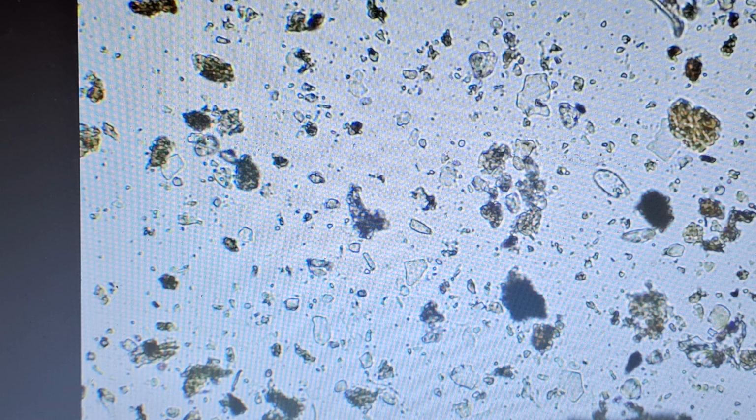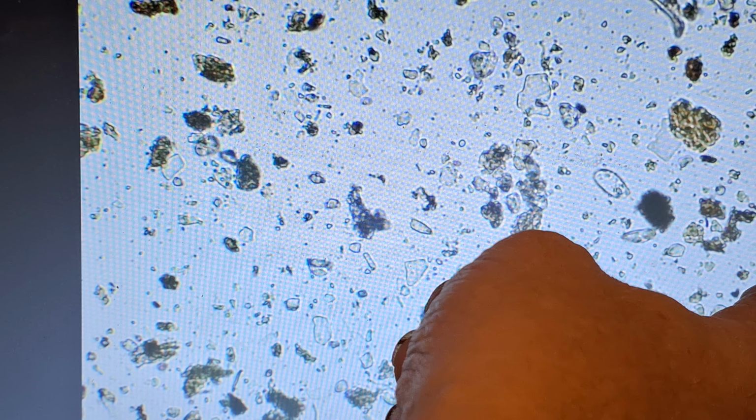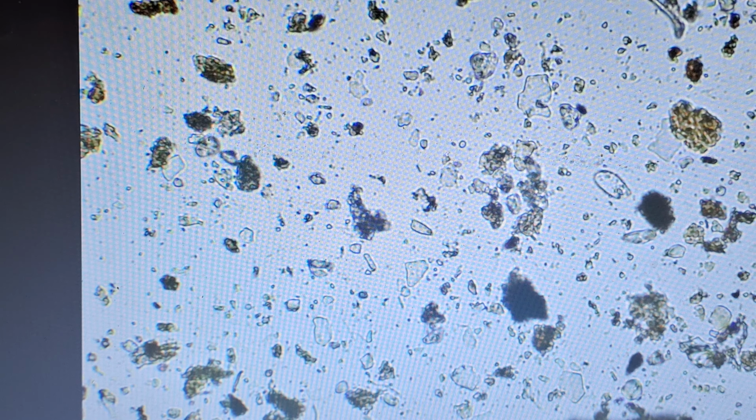We're seeing some nice aggregation all over the place. We can start to make out some testate amoeba if we look close, and some pieces of fungi. I'm going to zoom in a little bit. That was looking at it at 10x. Now we've gone into 40x. Here we can see a real nice testate amoeba. Another one there. Testate just means there's a shell. So there's the shell, the double wall around it, and a mouth on one end. Next to it, I saw at least one flagellate moving around there.